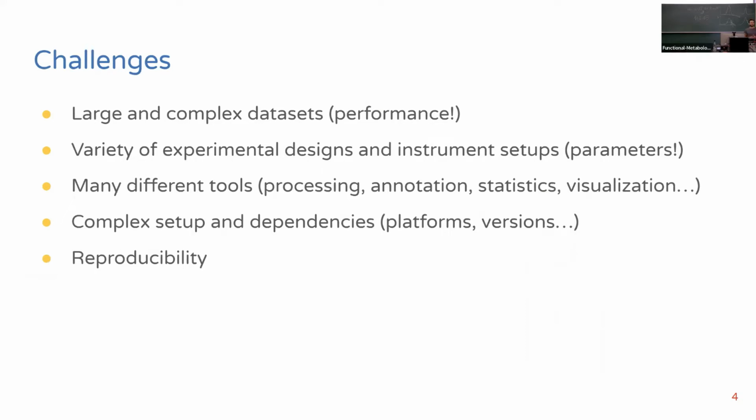Our sample sets are often large and very complex, so performance is definitely an issue here. If you have hundreds or even thousands of files to process, your typical laptop might struggle with that, and you might need to use a powerful PC that you have in your lab, or even upload your data to servers, high performance clusters.